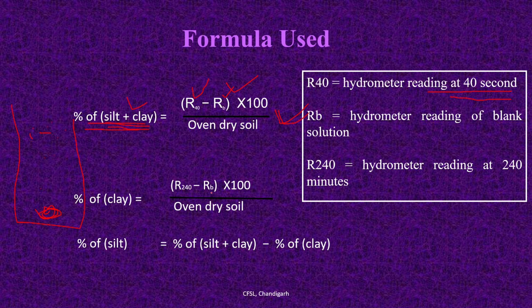Then you have to take the reading after 240 minutes, which is about 4 hours. After 4 hours, only the clay remains and the silt has also settled down.